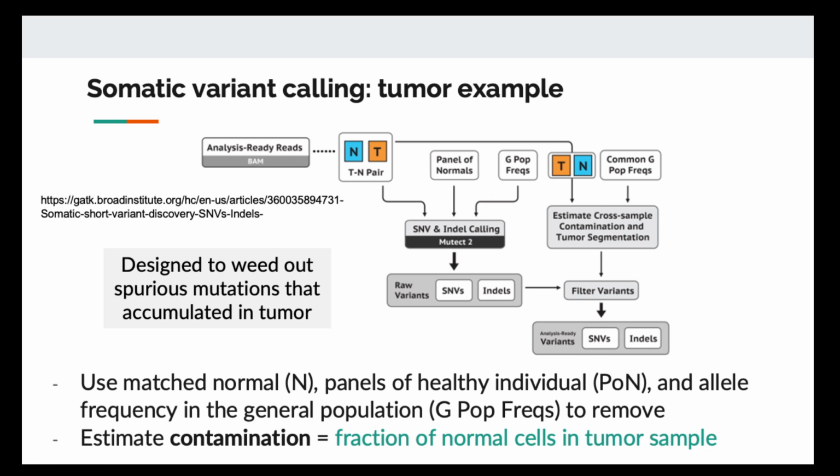Okay. So that's for the germline variant calling. We focus on finding the haplotype, and usually that's it, because the variant is usually very frequent, like 50% or 100%. For somatic variants, like in cancer, for example, it's a popular example. One of the problems is the low frequency that I mentioned.